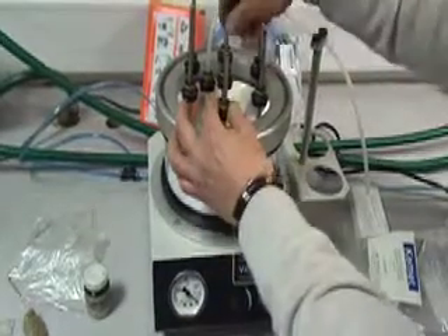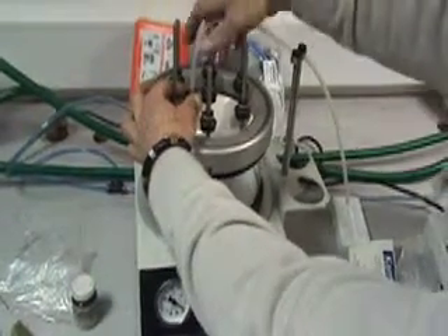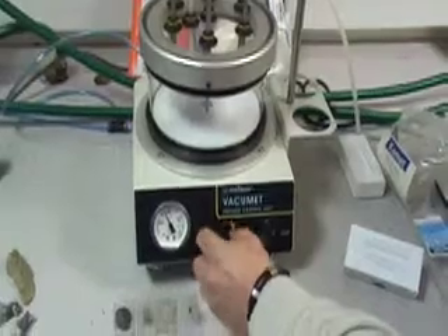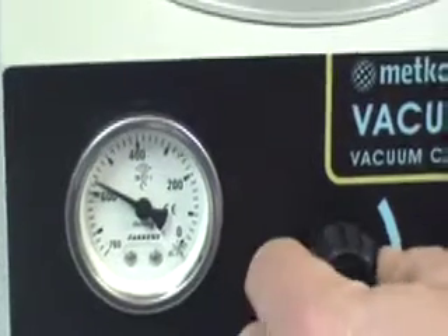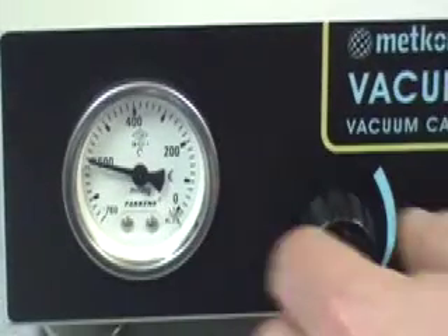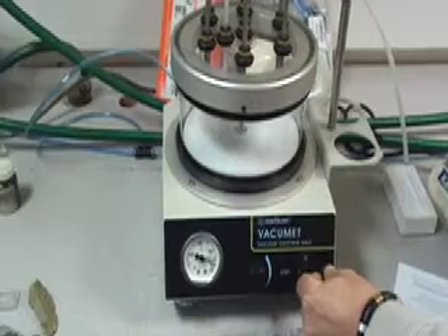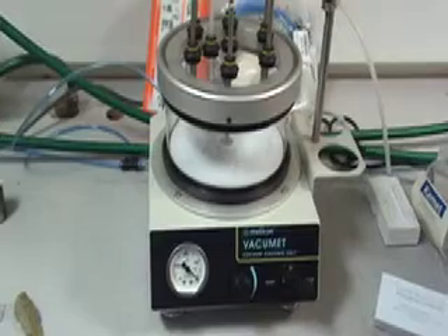Once your sample is within the vacuum unit, turn on and ensure all rods are creating a seal. Go to the start position and increase the pressure to 600. Allow it to sit there for three to four minutes. Then turn the unit off — this will allow the resin to impregnate the rock and air to escape.